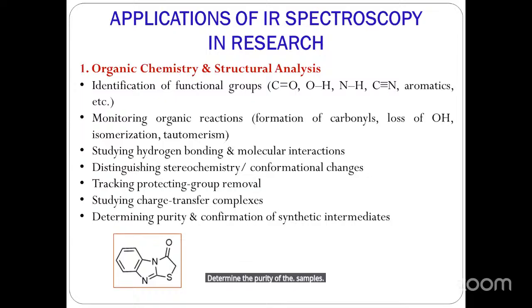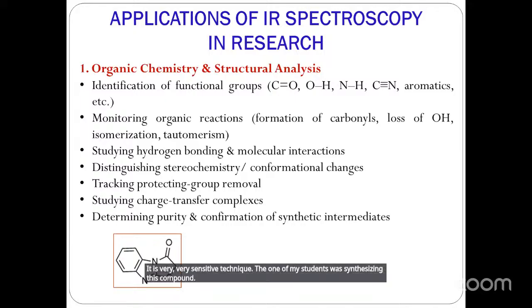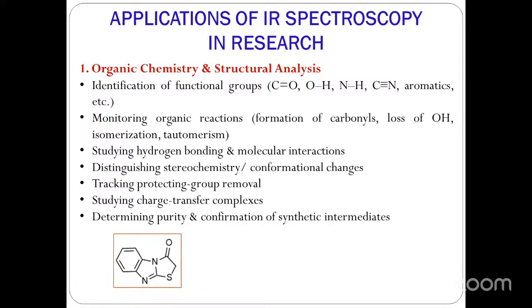Now, a very important thing about IR spectroscopy is that it is a very, very sensitive technique. A very small amount of any compound can be detected. So one of my students was synthesizing this compound, and we were getting two spots in the TLC.